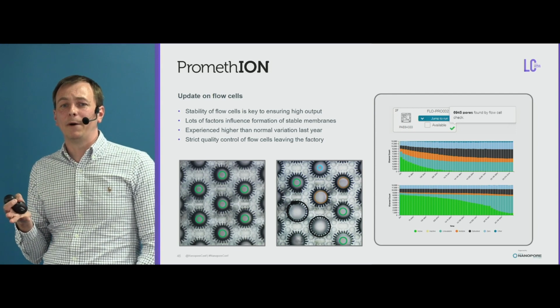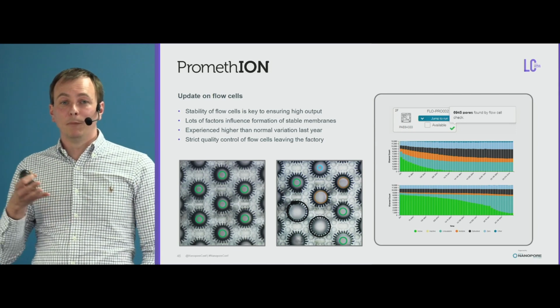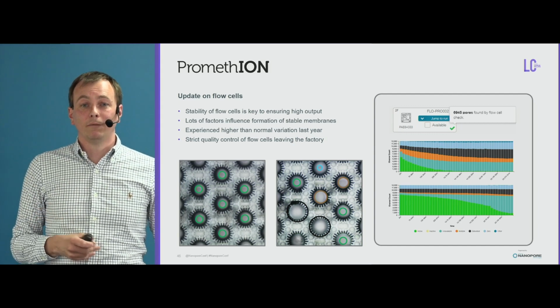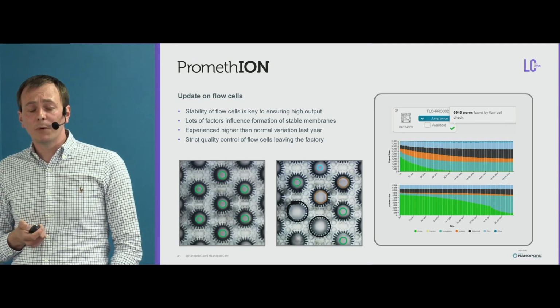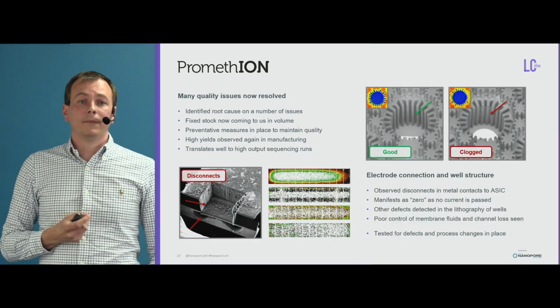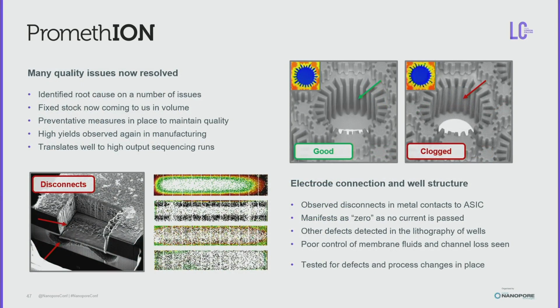And there's a lot of sequencing output, so that's performing pretty well. And the one above it, unfortunately, has more flow cell fails, and you can see that really affects your flow cell performance. So what's causing this variation? There are two issues I want to point to. Both of them have been resolved now.